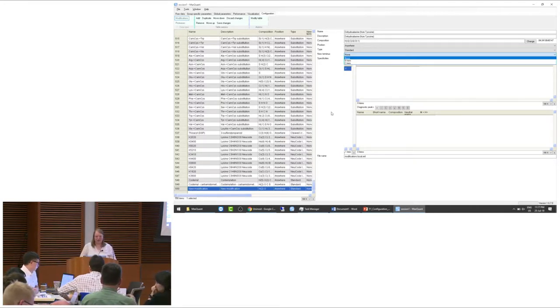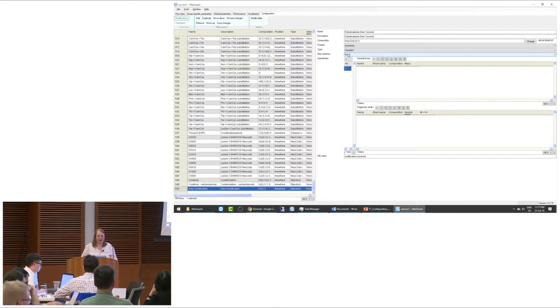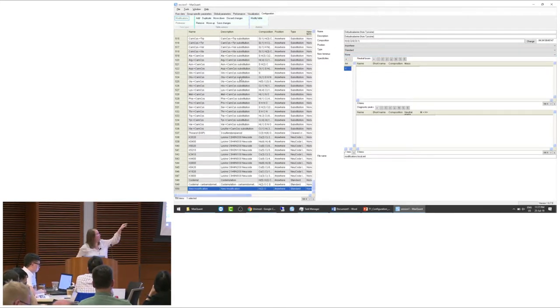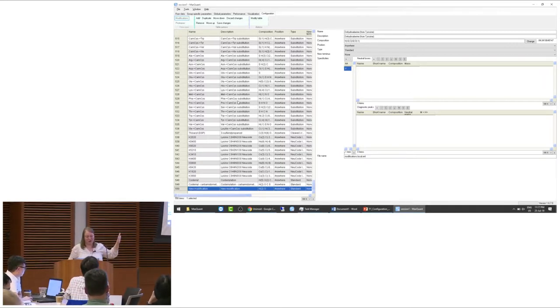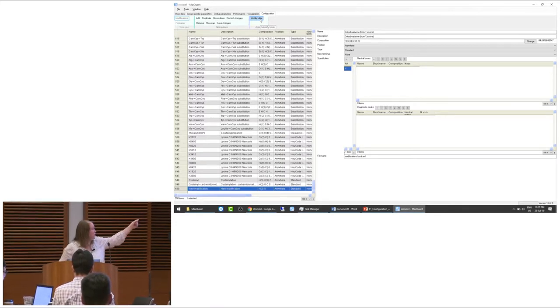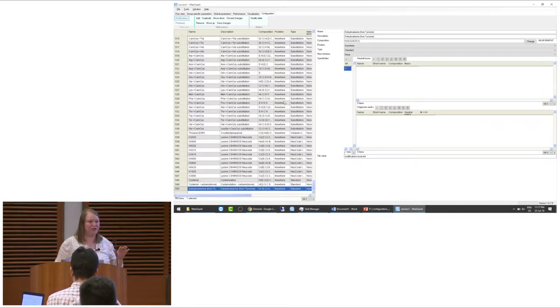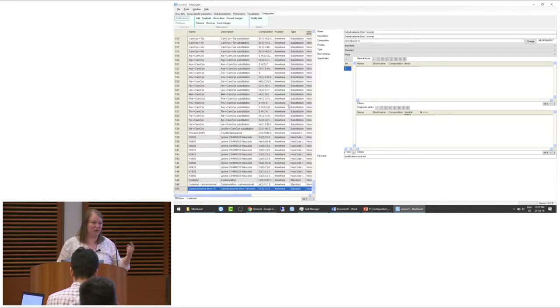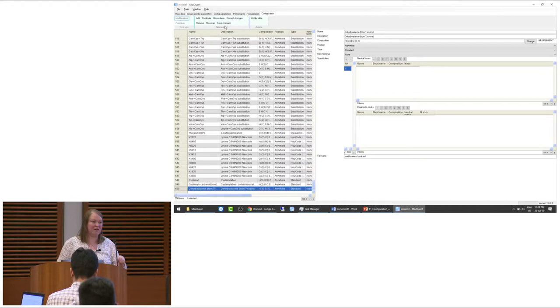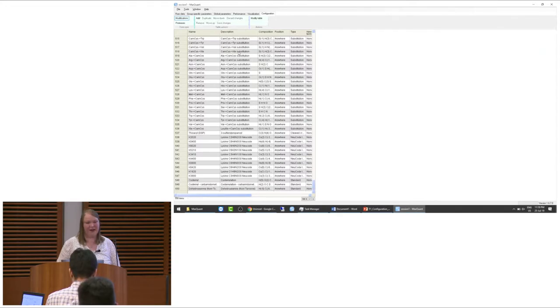Now I want to highlight: if you have made changes on that side, you need to click Modify Table first. If you click somewhere else in the table before doing that, all changes are gone. After clicking Modify Table, you will see the values updating at the bottom. But if you would start MaxQuant now, you would not see the changes in your variable modifications. So you also need to click Save Changes so all changes are saved to the file system and loaded every time you start MaxQuant.